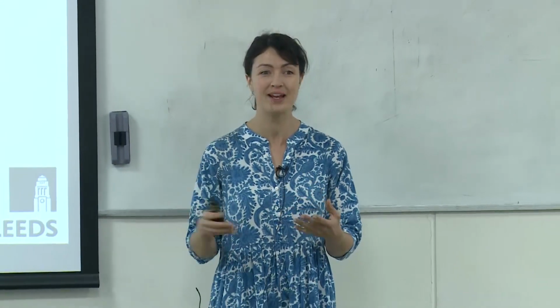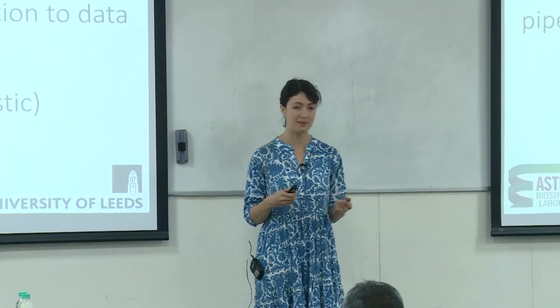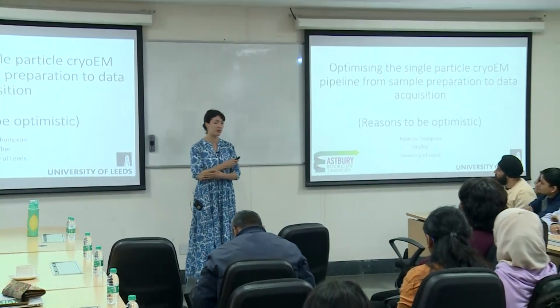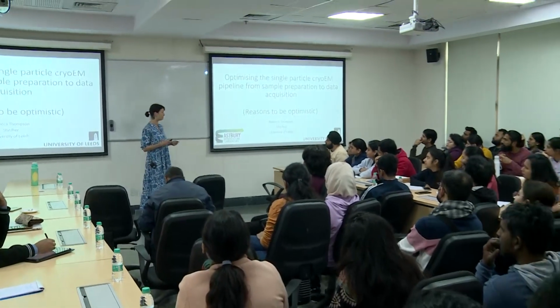So we've got lots of structural biologists in the room, and I guess with the new technology that's coming into your institute, hopefully many more of you will be getting interested in single particle and cryo-electron microscopy and also tomography workflows. So as I said, I'm going to talk to you about some of the work we've been doing in my facility team around particularly the single particle pipeline.